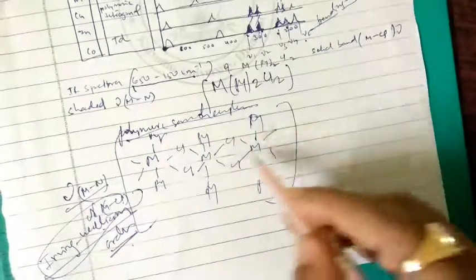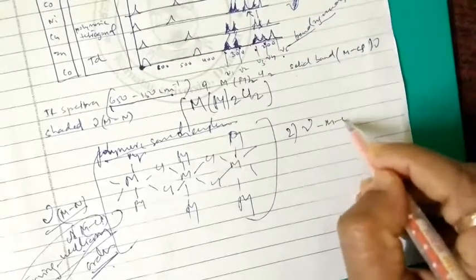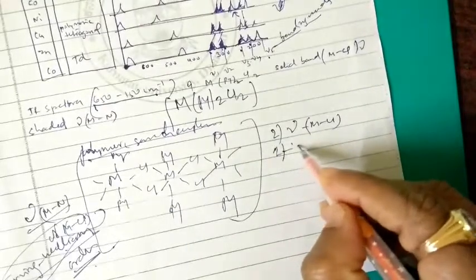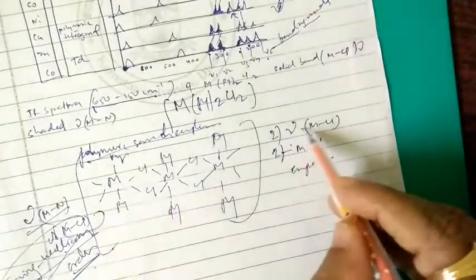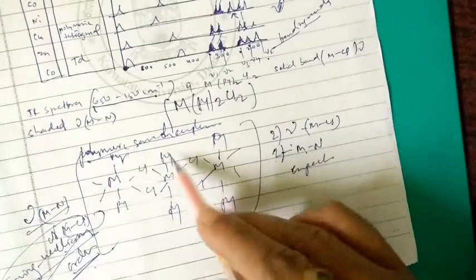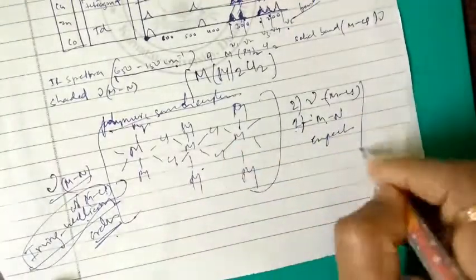And in this type of polymeric structure, two vibrations of metal to chloride and one vibration of metal to nitrogen are expected here. From this structure you can see two vibrations of metal chloride and one vibration of metal to nitrogen of pyridine. So this is what we see in the IR spectra for a polymeric octahedral complex of C1 symmetry.